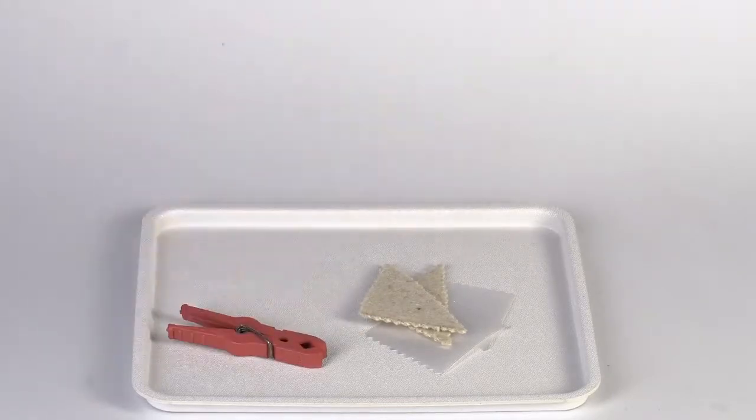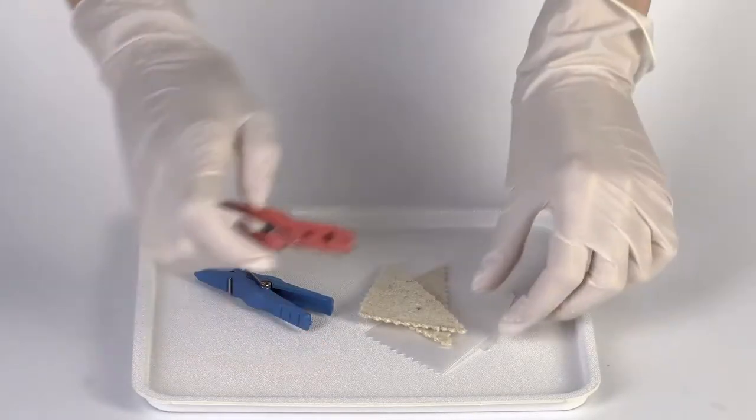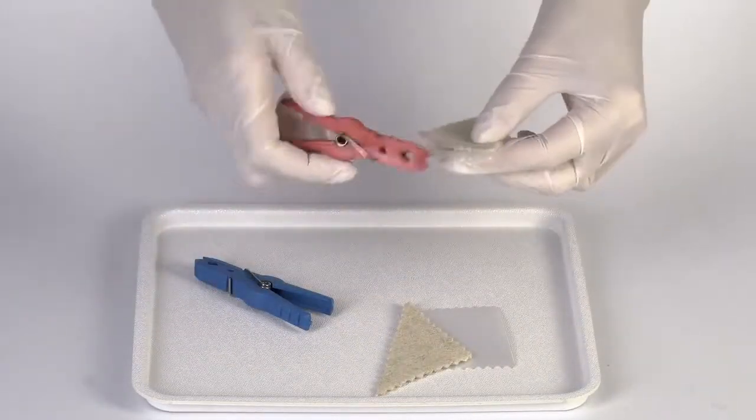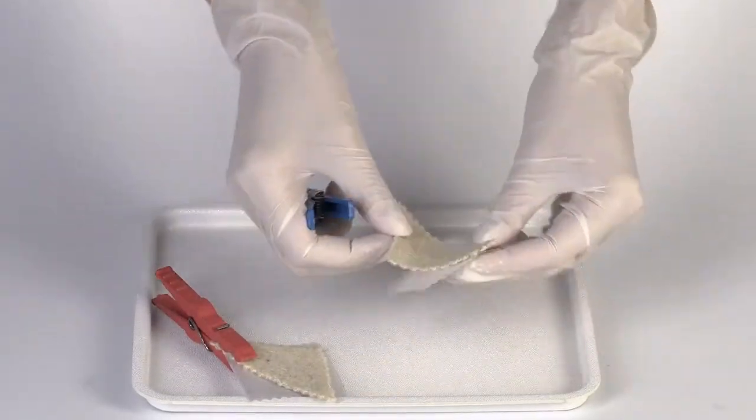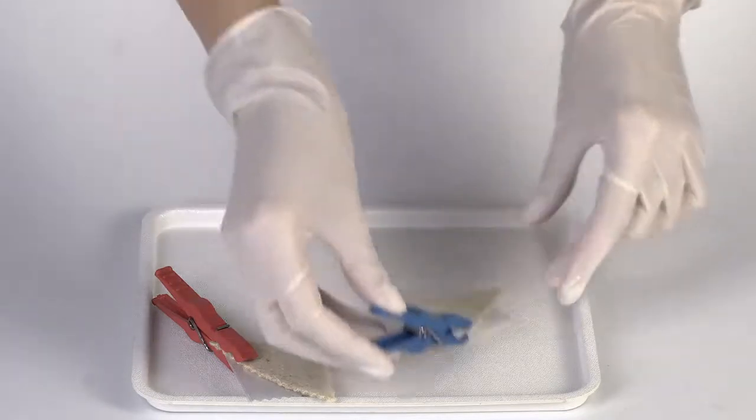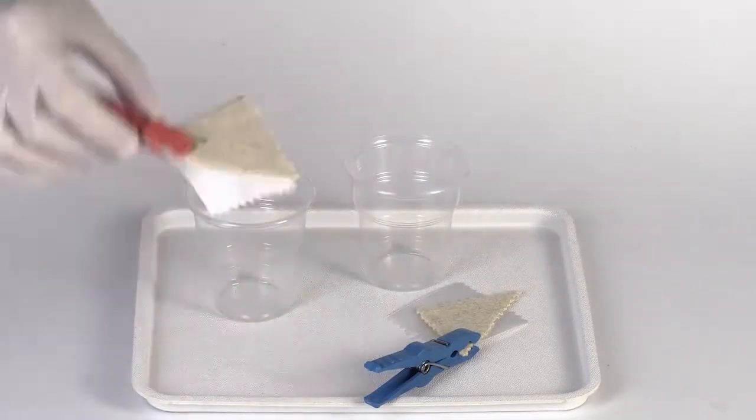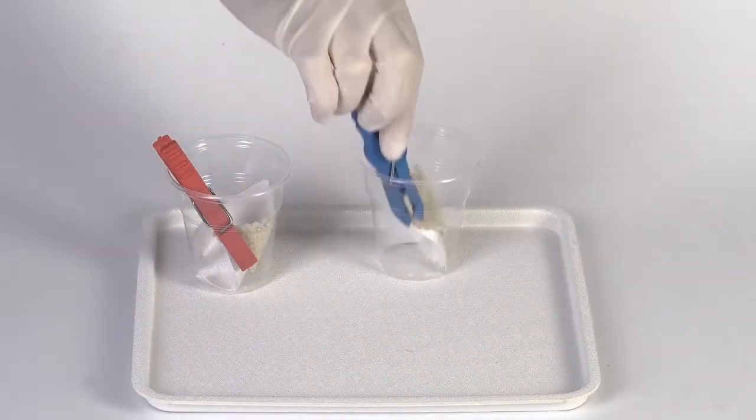Take the clothespins from the set. Clip together one piece of wool and one piece of polyester with the red clothespin. Do the same with the blue clothespin. In each pin, you should have two pieces of different fabric. Take two plastic cups from the starter kit and put the samples into the cups.